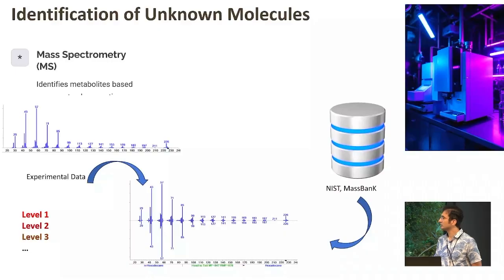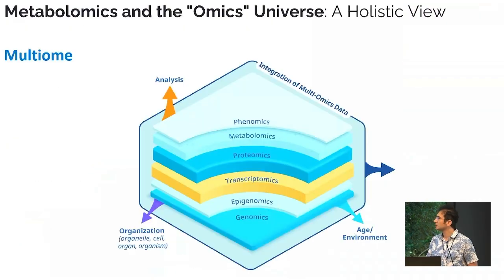We can use different similarity measures for this purpose. One of the most used methods is the Tanimoto similarity coefficient, but different similarity measures can be used.